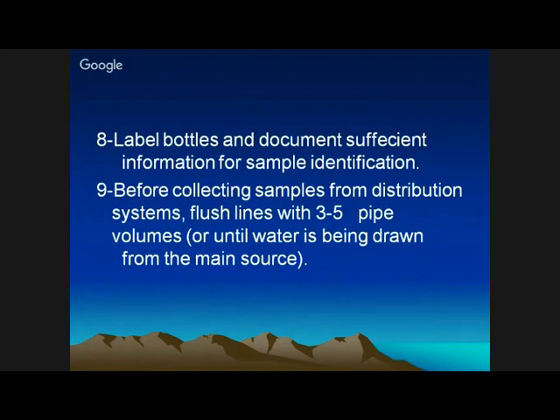Eighth is to label bottles and document sufficient information for sample identification. Ninth, before collecting samples from a distribution system, you have to flush these lines so that there may not be any contamination due to those pipes or the distribution systems.